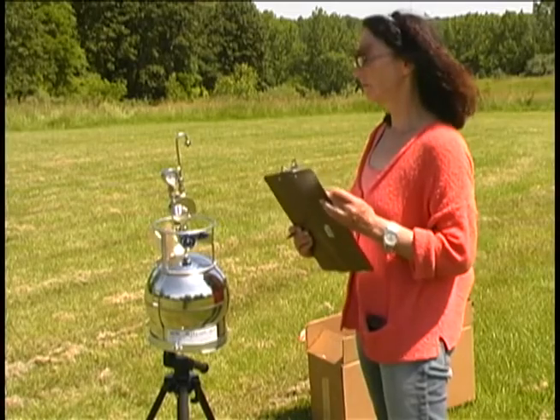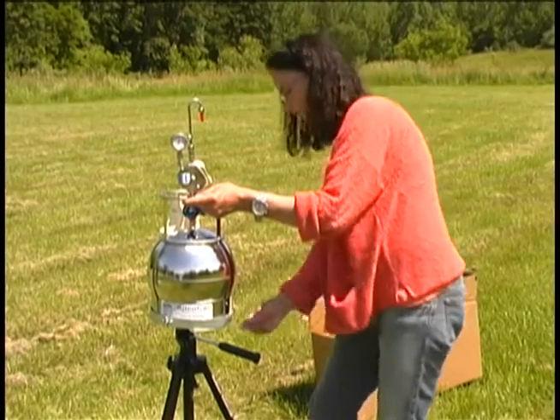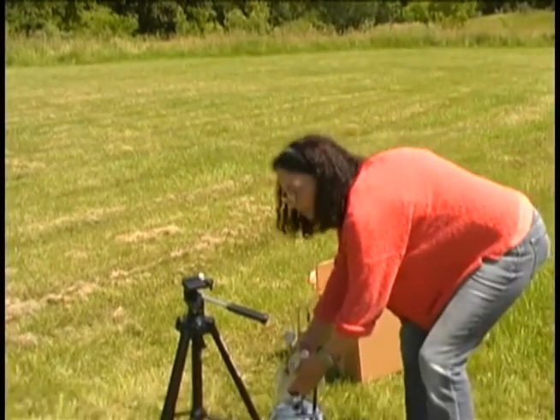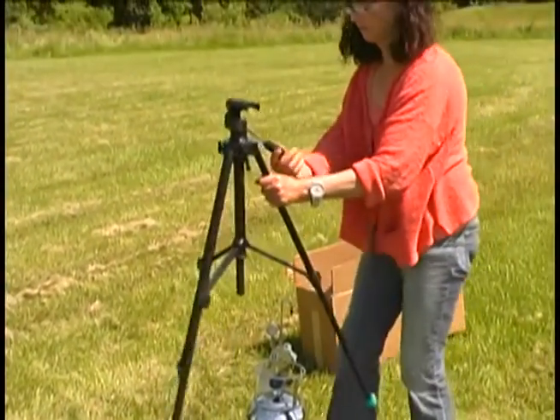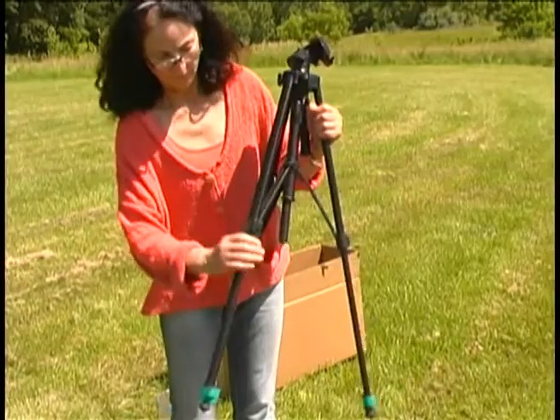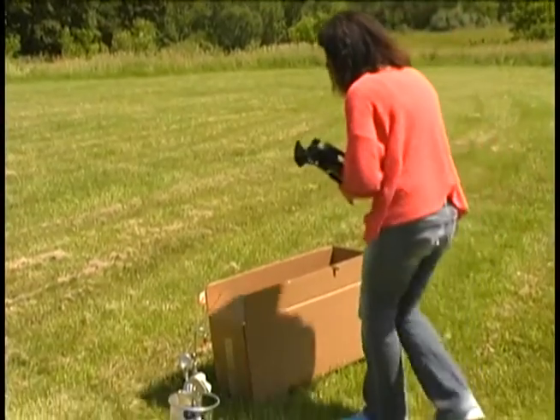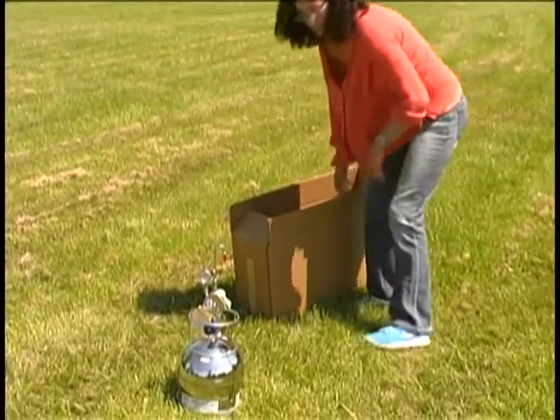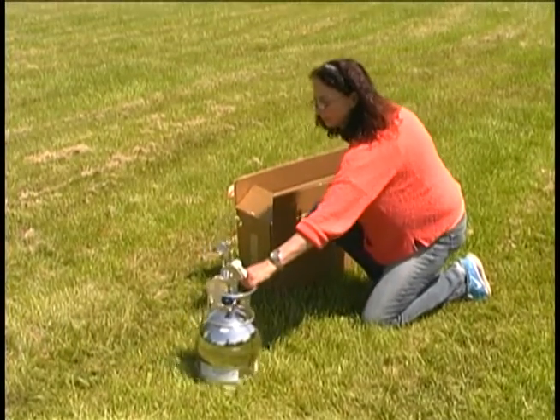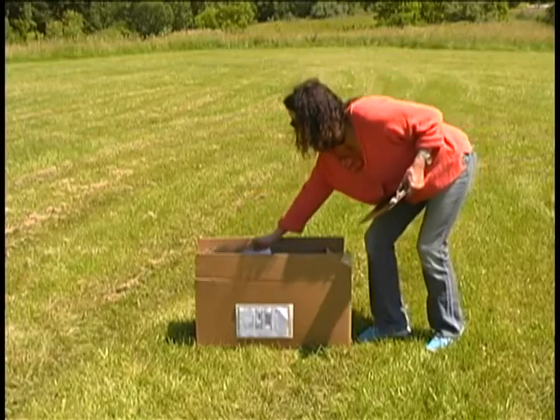Step nine: place the red plastic tip at the end of the sampling cane. Step ten: remove the canister from the tripod. Close up the tripod and place it in the box. Arrange the material inside the box to secure and protect the tripod. After you've placed the canister in the box, arrange the shipping material to protect the sampling cane. Place the field log in the box.